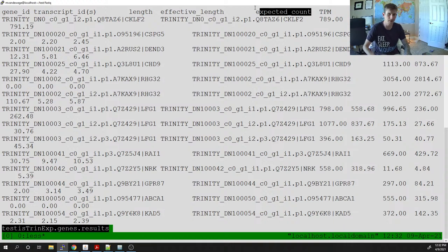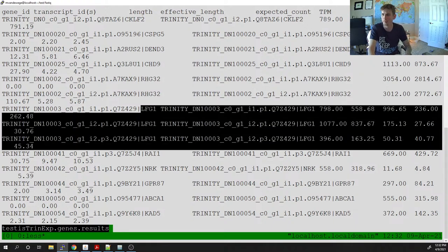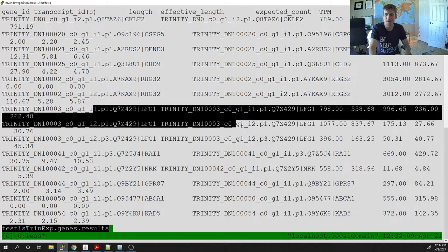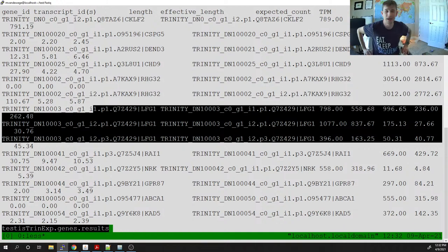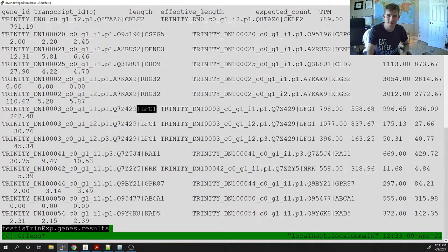If we look at the transcripts, there is some variation in which transcripts are actually expressed. For example, three different transcripts derived from the same gene can have very different read counts — 996, 175, and 50. I'm going to write a script to sum all of these together, because I care about gene expression, not individual transcript expression.